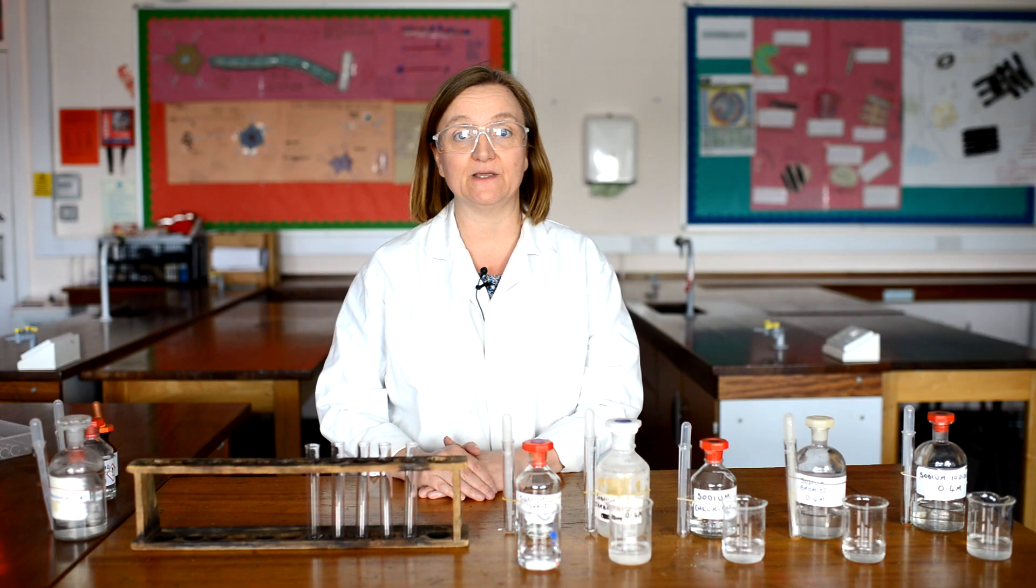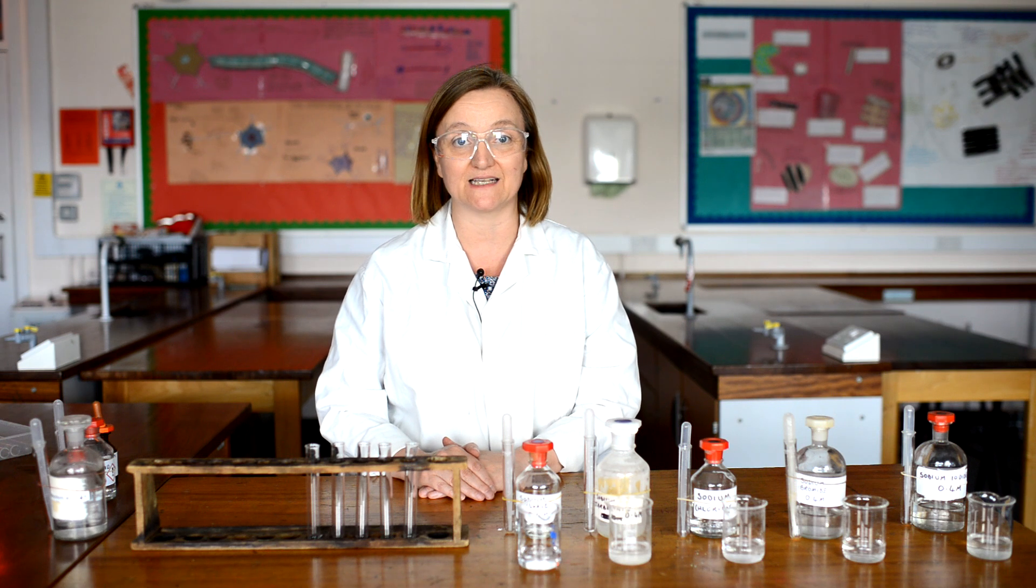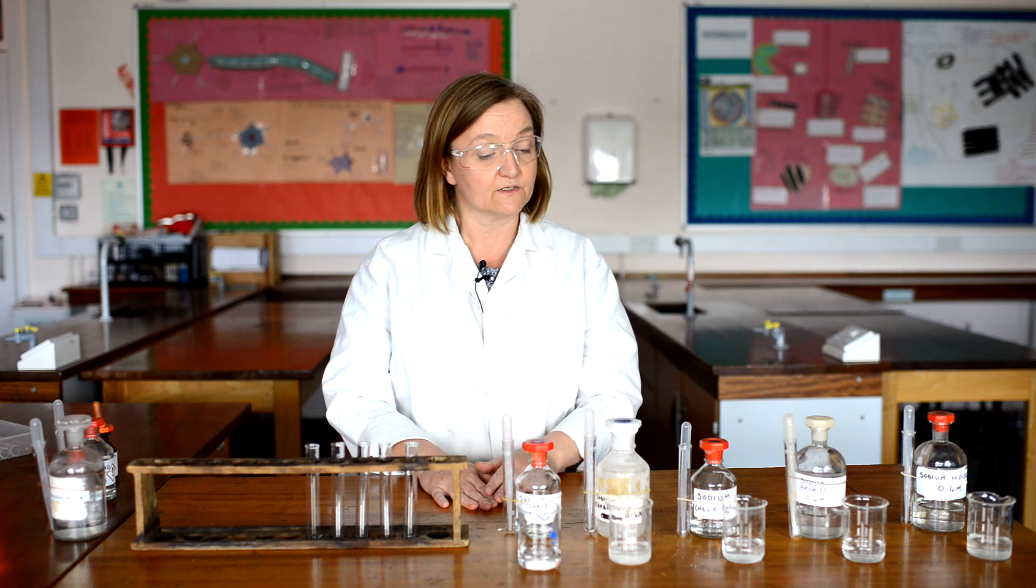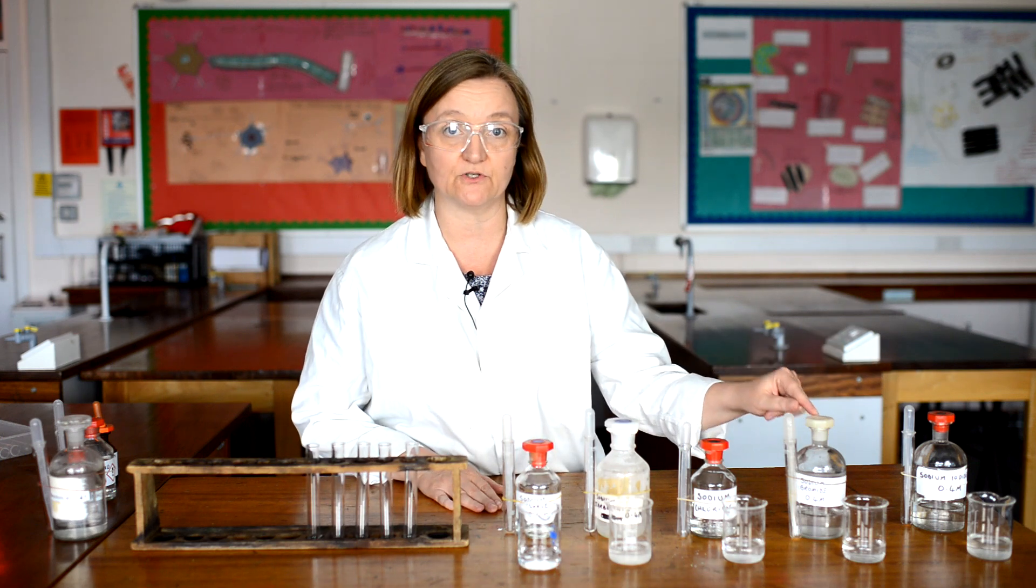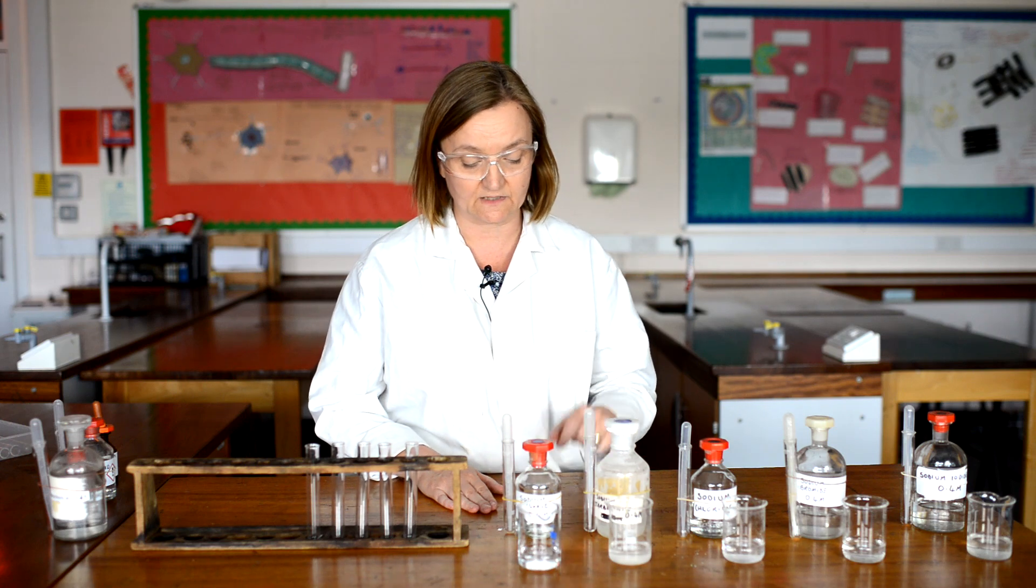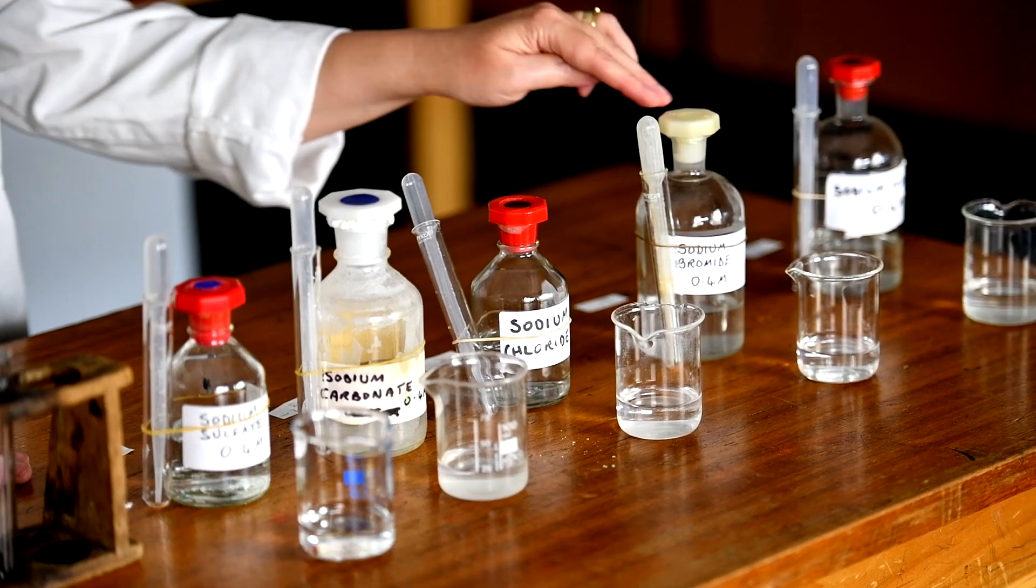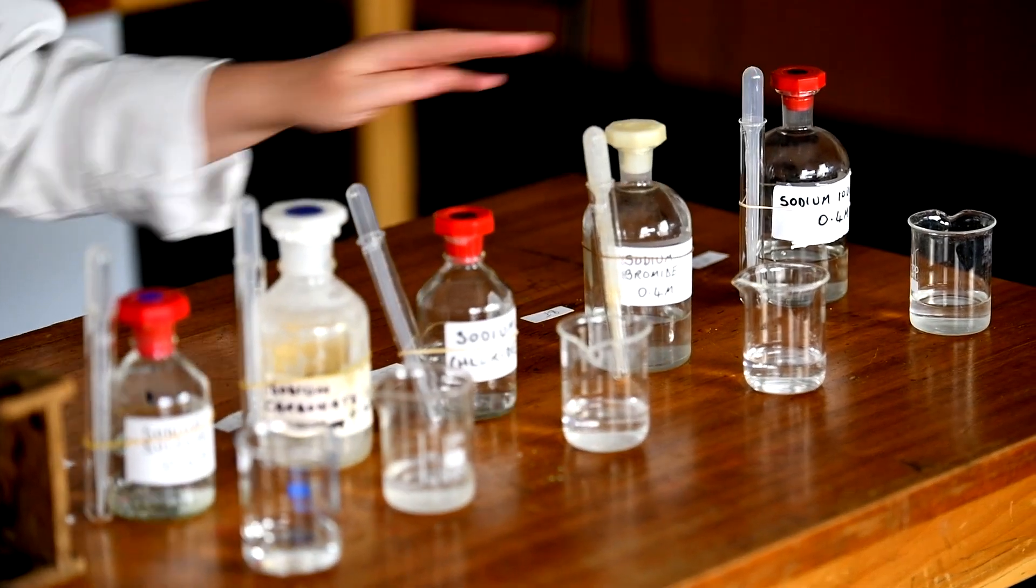So now that we've seen how we can test for different metal ions in solution using flame tests, we're going to change our attention to the non-metal ions. So now I've got five solutions, all that contain sodium, but different non-metal ions with it. So I've got sodium sulphate, carbonate, chloride, bromide and iodide. And we're going to look at three simple tests we can do to identify these different ions.